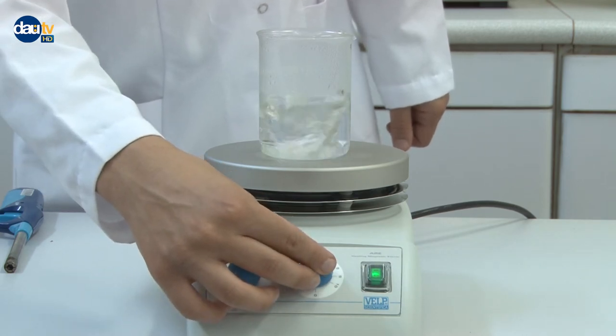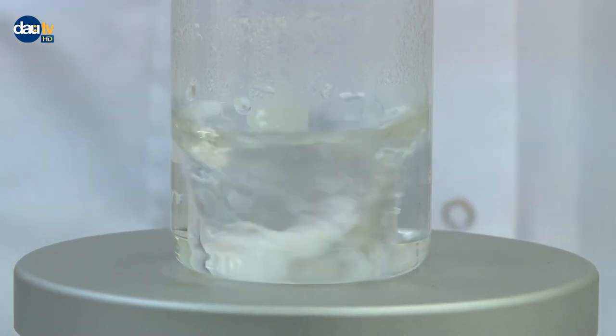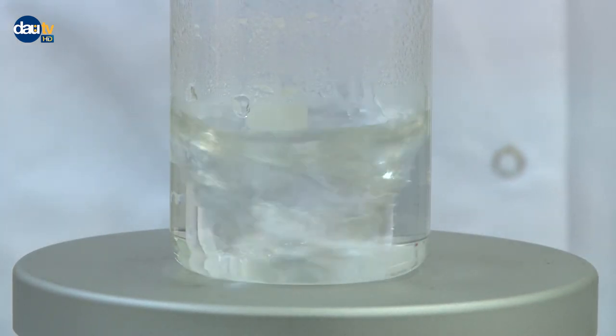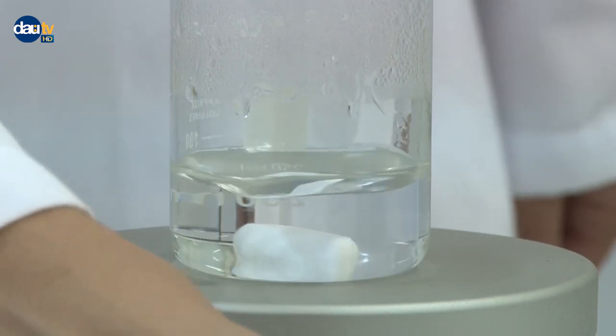Turn the magnetic stirring speed and temperature to zero when heating is done.